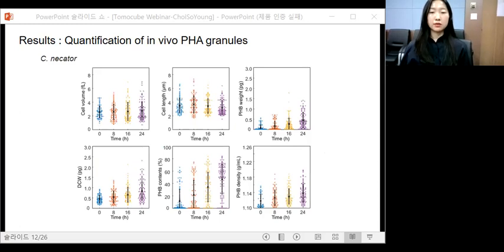These are quantification results for C. necator cells. For statistical analysis, about 100 cells were randomly selected at each sampling time. As I explained, we obtained the values of cell volume, length, PHA weight, cell weight, PHA contents, and PHA density for single cells.